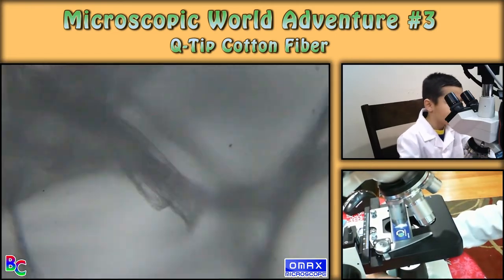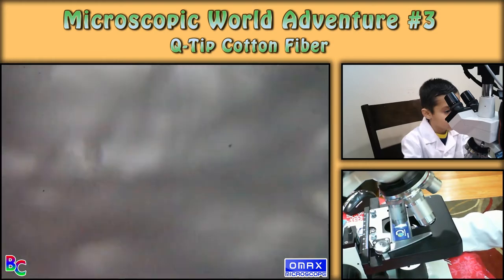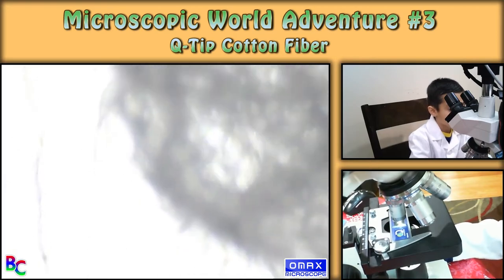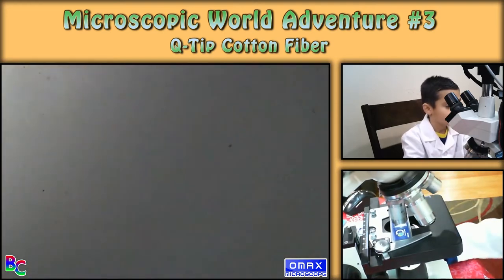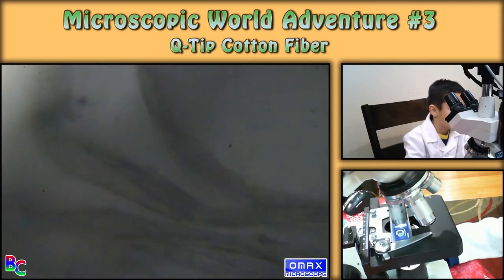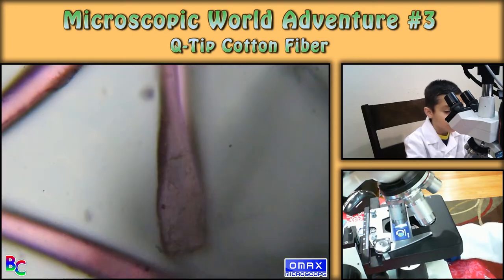Whoa, I need some light. I'm gonna take a look at the ink. Where's the ink? I'm gonna zoom and find the ink. Now I'm zooming back in — okay, this is very hard to see, but there's the string. Oh, there's the ink! Oh my god. What is that? It looks like something brown is in there.